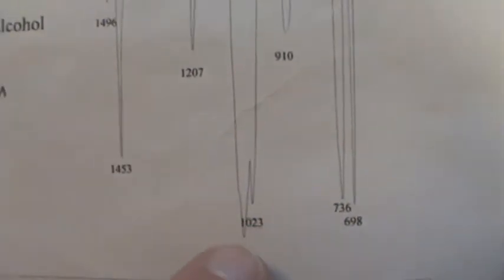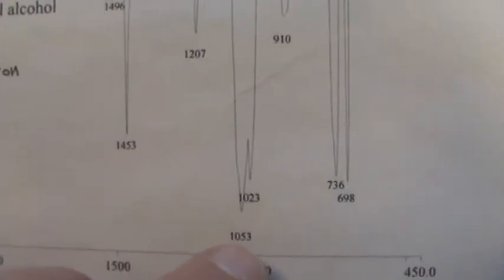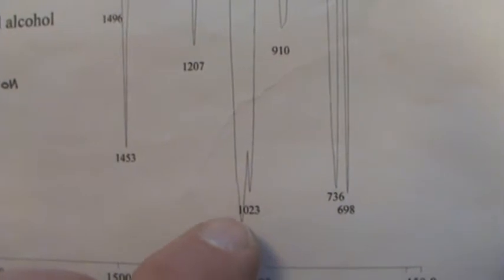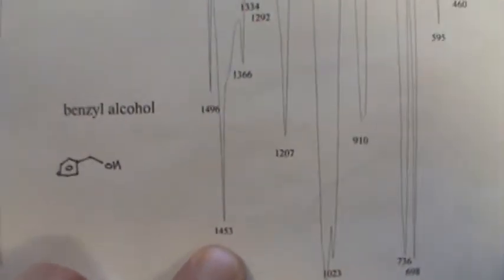As we go down to benzyl alcohol, same region, benzyl alcohol is a mono-substituted one. You see the same 2 strong absorptions, mono-substituted, out-of-plane bend. And yes, this is the benzyl alcohol, so we're looking for a CO stretch of an alcohol. 1053, the strongest one there, is probably it. You could actually circle both. One could be symmetric, the other asymmetric.